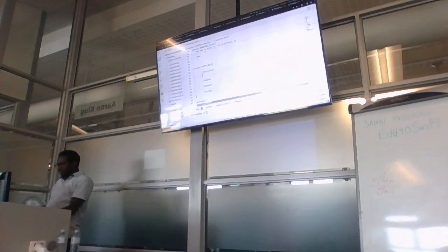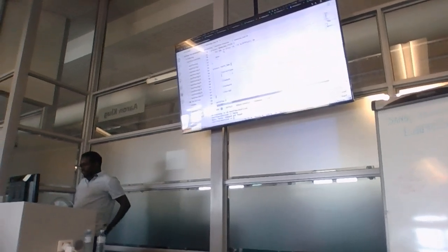So directives here. This is a tool that is not available at the moment. We don't have it. If you try typing fastp and auto completion, that tool is not available locally, right? So if I run this, it will tell me command not found.